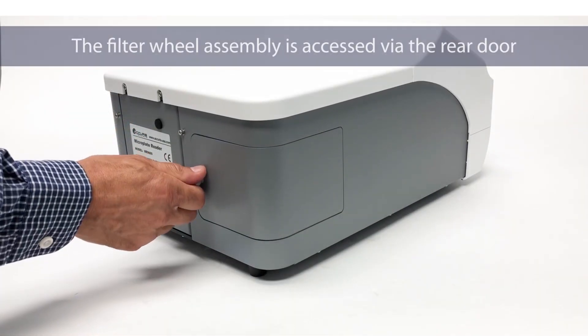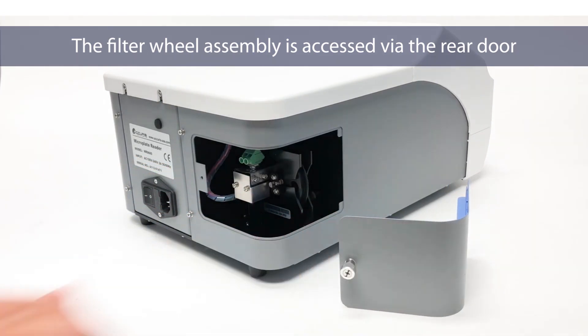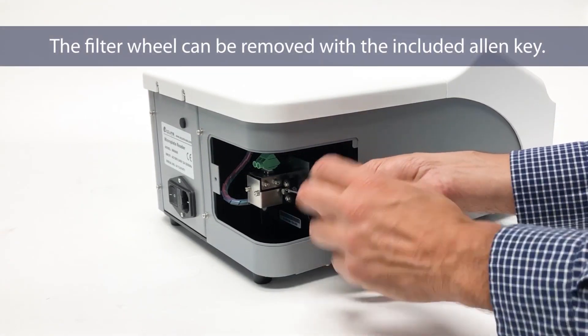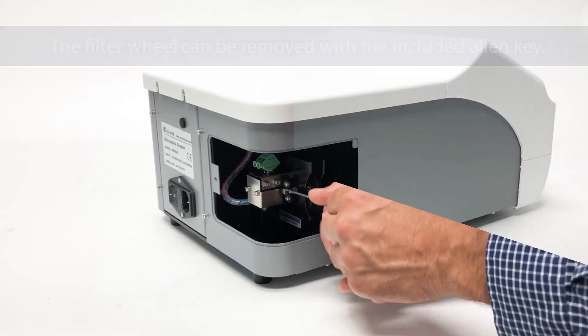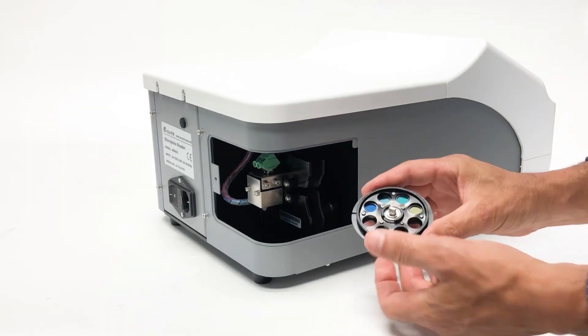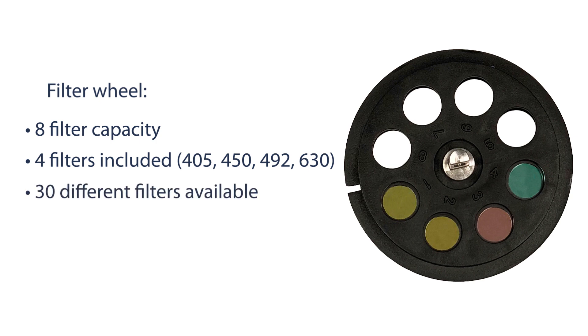A rear door panel can be removed to access the instrument's filter wheel, and the filter wheel is easily removed with the included Allen key. The filter wheel can hold up to eight filters. Four common filters are included, and a total of 30 filters are available to cover wavelengths from 340 to 750 nanometers.